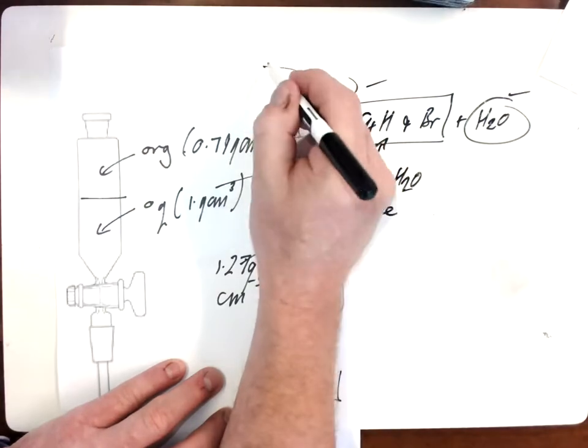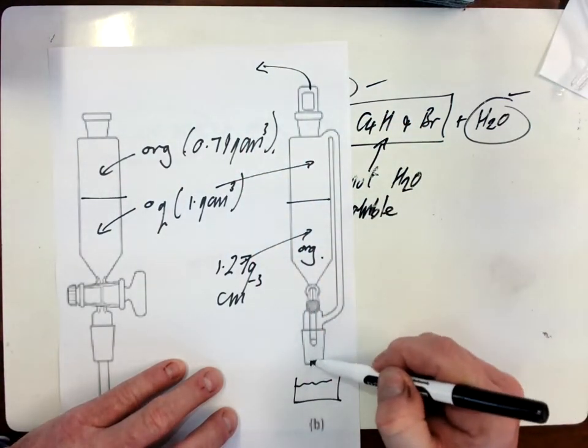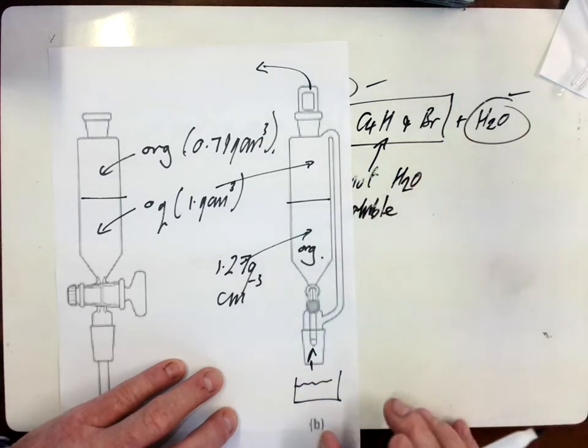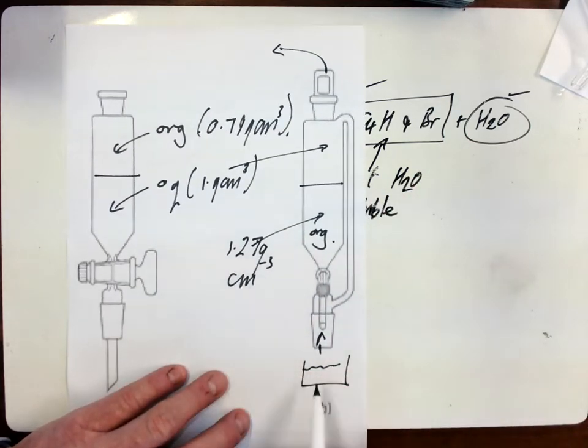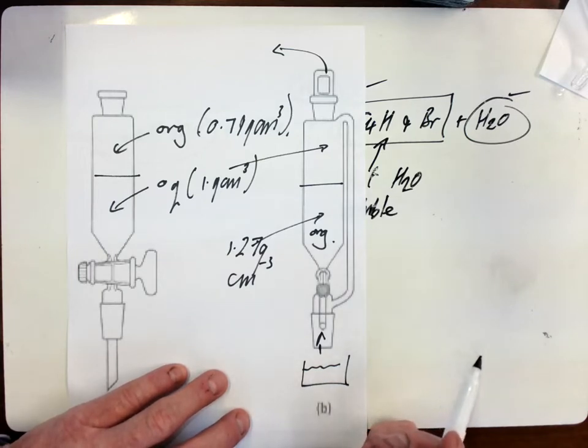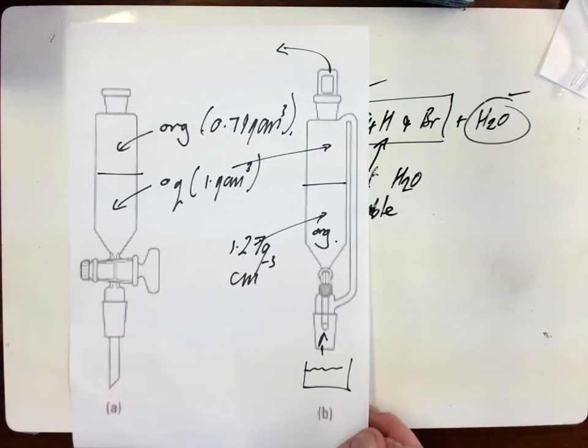Always take the stopper out, by the way, before you do this, otherwise it will just simply suck air in from the bottom and mix everything back up again, and you won't get a good separation at all. So, you keep that layer. Now you might think, oh, that's got to be a pure layer by this stage. Well, it's purer, but you still have a variety of things in here in trace amounts, very, very small amounts, that you want to get rid of.